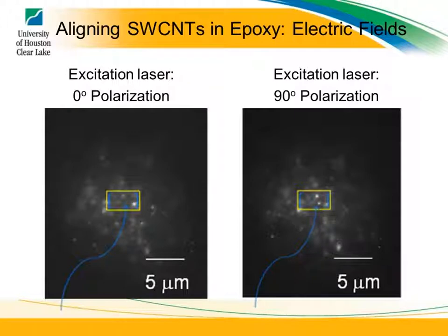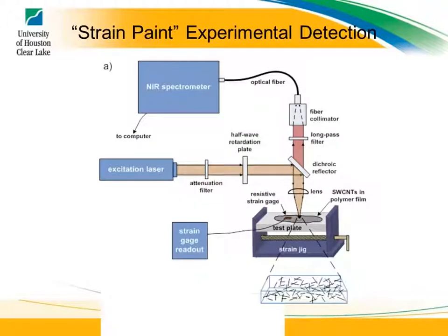Well, I know that nanotubes that are laying flat on the surface will emit light out in a cone. And then we have to focus that back into the detector. If you don't focus it, you really get a low effect. But still, they might have slightly different orientations. Yeah, okay, keep that in mind.